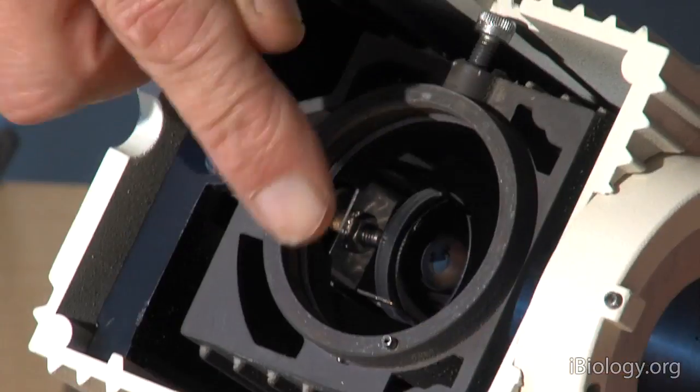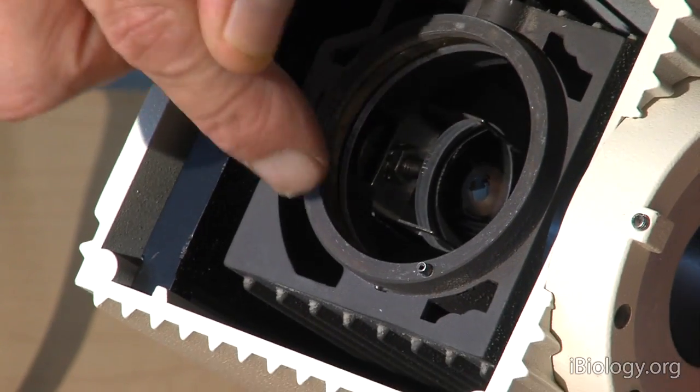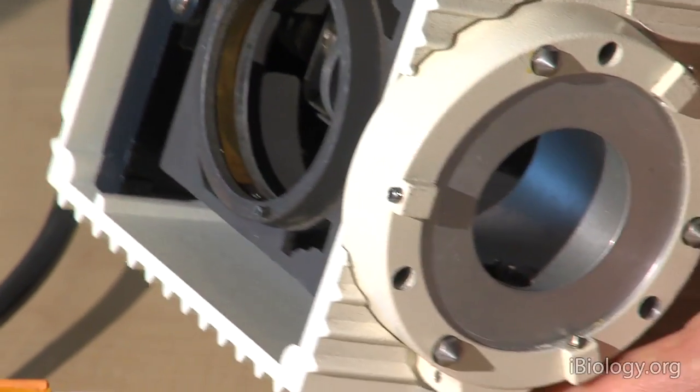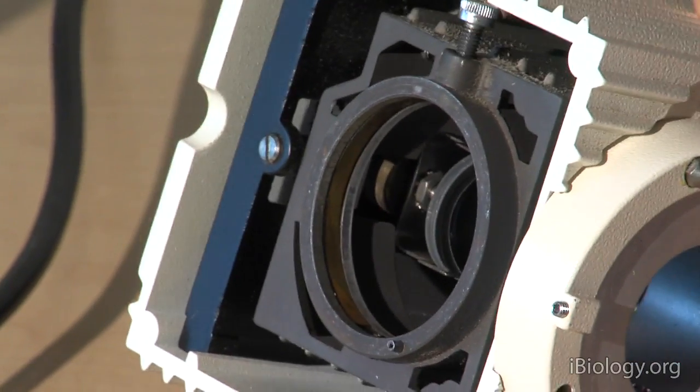Also inside this lamp house there is often a mirror, a parabolic mirror, and that reflects the light going into the back direction so that it comes out in the front and you get more light coming out. This is a mercury arc lamp.